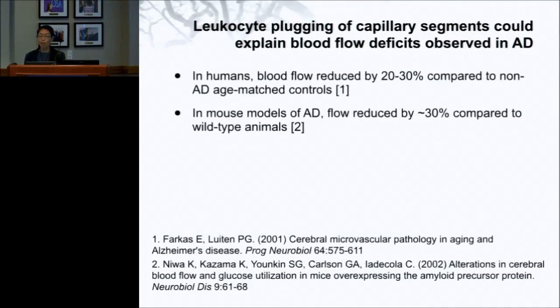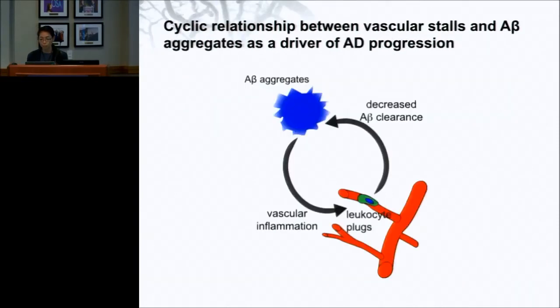So our experimental results actually match very well to the clinical picture. What we see in the mice in terms of how much blood flow reduction there is matches quite well to what clinicians see in human patients. So one of the reasons this is exciting, though, is that there's a lot of groups that have discovered that changes in blood flow, especially if you decrease blood flow, actually leads to an increase in this A beta aggregation. And there's lots of different mechanisms for why that might happen.